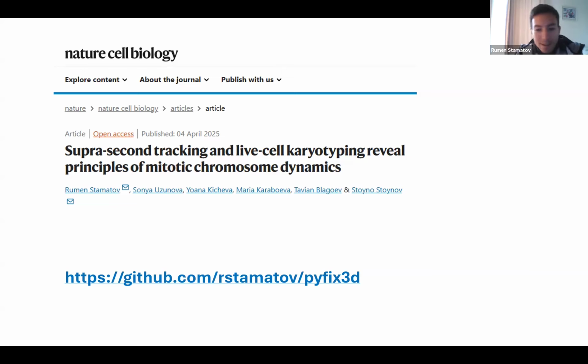Also, like I said, this is open source. So it's open to any improvements or suggestions or integration into some of the existing platforms that we already have. So whoever is interested in that, you can just fork the repository, do some improvement, and then send it to me, and that will be great. I can update the link. So it's really up to us to use it and improve it in the way that we want.